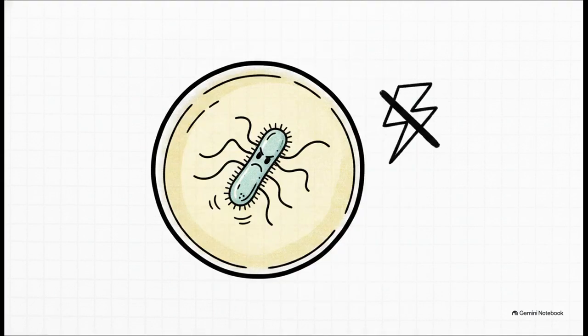Now, sometimes a lab faces a highly specific nightmare scenario. Enter CLED agar, which stands for cysteine lactose electrolyte deficient agar. It's absolutely crucial for urine cultures. Now, it differentiates lactose fermenters beautifully, but the real secret weapon here is the electrolyte deficient part. Certain highly motile bacteria, specifically Proteus species, love to literally swarm rapidly across an entire petri dish, covering up all the other evidence. By removing electrolytes from the agar, CLED chemically paralyzes the Proteus, stopping the swarm dead in its tracks. A real game changer.